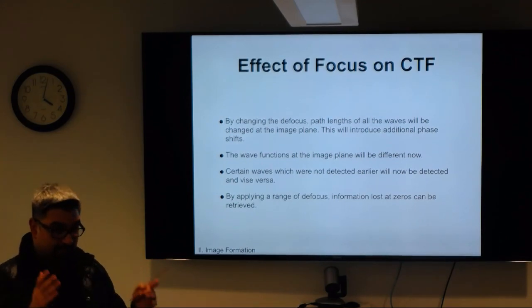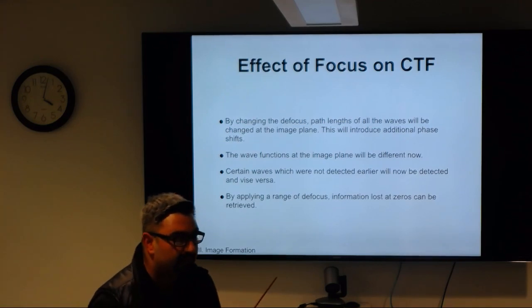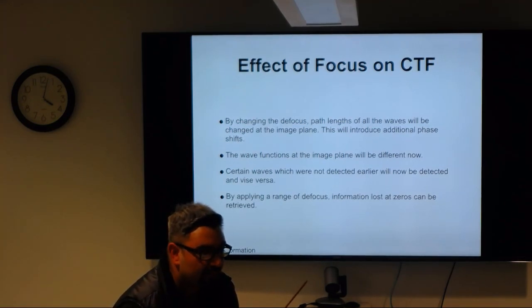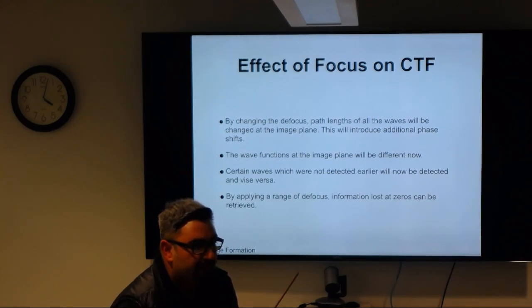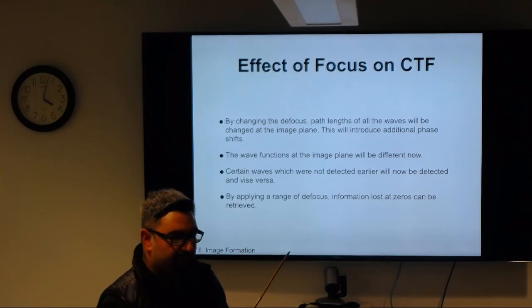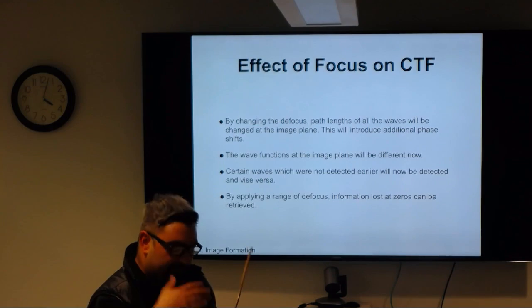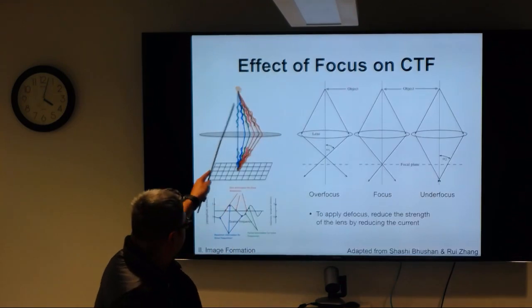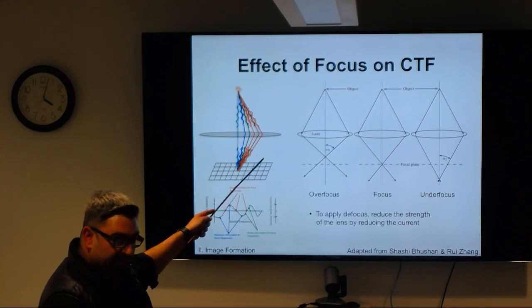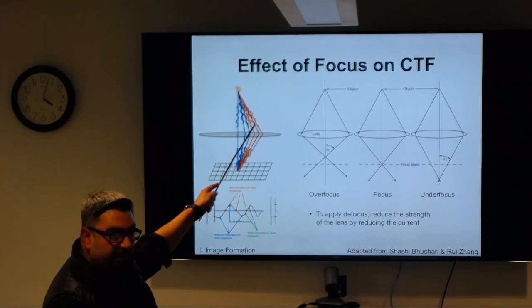Okay, and so I'm going, yeah? So before we can talk about the destructive waves that cause that loss of energy, is that caused by the aberrating electron? So just to understand your question, you're asking if this nature right here of the wave is caused by the scattering from the specimen, right?